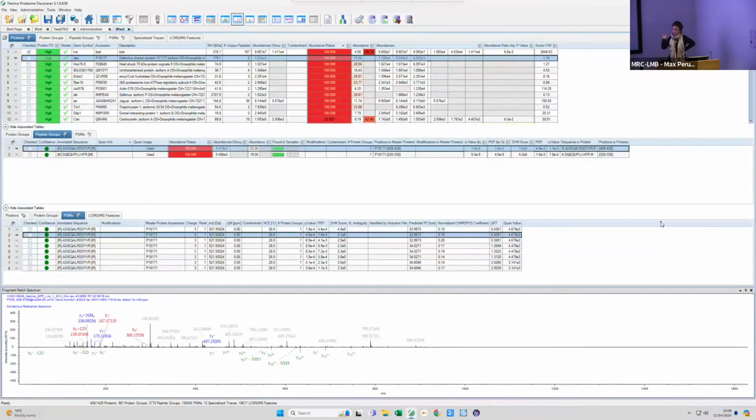It will show you your fragment spectra, which is this one, and it will also show the theoretical fragment spectra. This is because I'm using a tool called Chimerys to do the DIA identification. It makes a theoretical fragmentation spectrum that includes not only the masses of the fragments, but also the intensities. This is quite a complex tool. But you can also see what fragments were assigned to that specific spectrum that belong to the peptide that's supposed to be there.